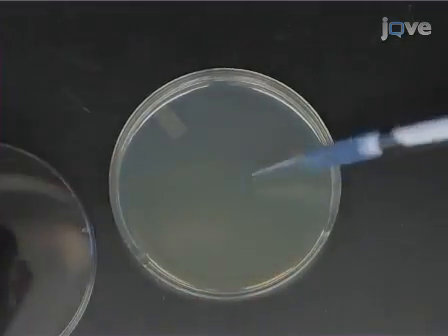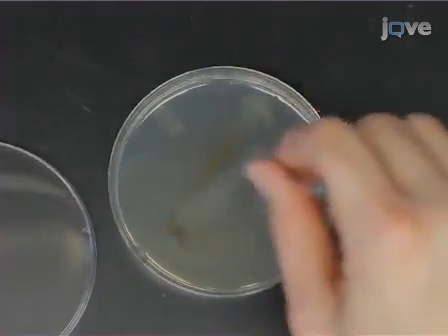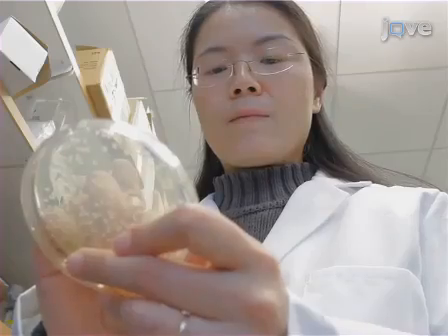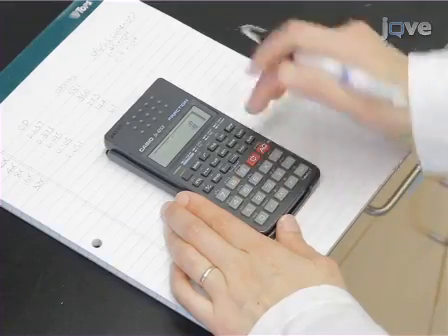Evenly seed 0.4 ml of bacterial suspension of each dilution on a 100 mm LB agar plate and incubate at 37°C for 18 to 24 hours. Count the number of bacterial colonies grown on each plate in order to calculate colony-forming units per milliliter for each sample.